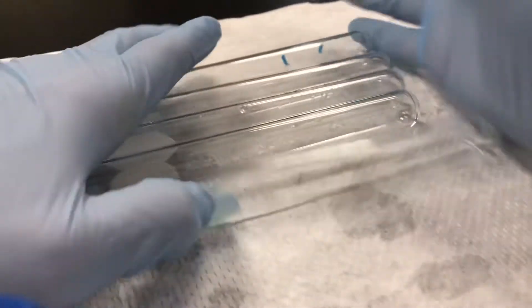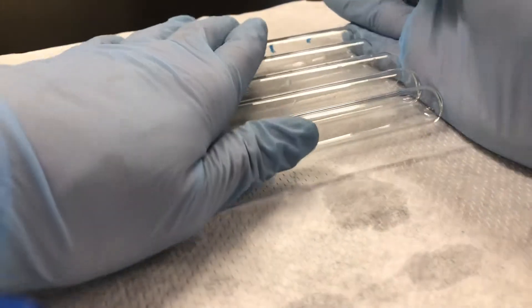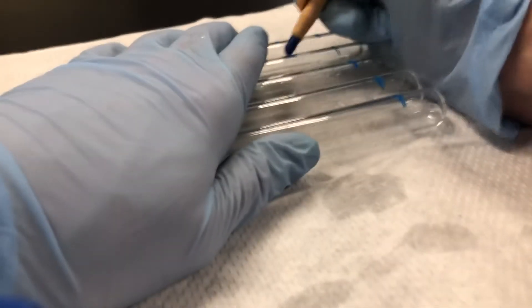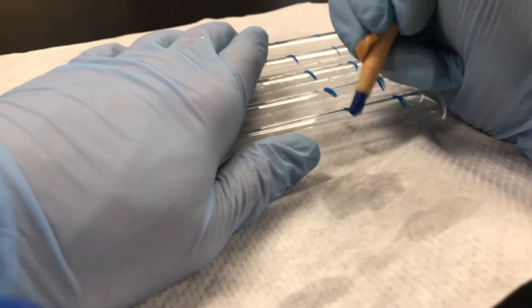I'm going to take the rest of them, line those up, and mark at the two approximately, then mark at the four. So now I have my ten test tubes that are marked at two centimeters and four centimeters. I'll stick those in my test tube rack.